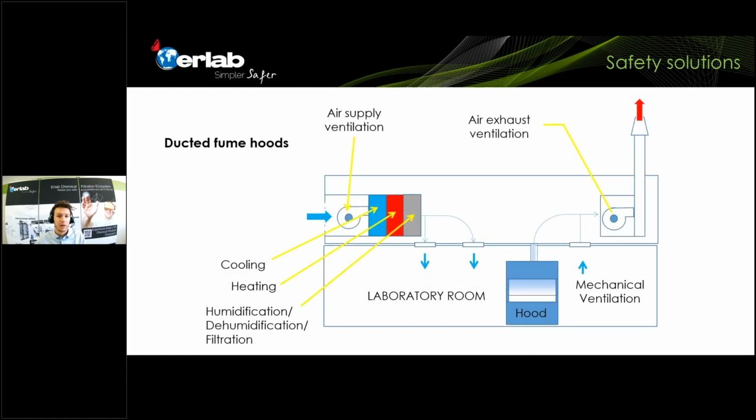If we go into depth into two of the safety equipments that are used the most frequently in labs, then we can tell you a bit more about those. So let's start with the ducted fume hood. A ducted fume hood is a fume hood in which you will work with chemicals and the air will be extracted to the outside. So all the chemical hazards that are coming free in the lab, they will be exhausted by a ventilation to the outside air.